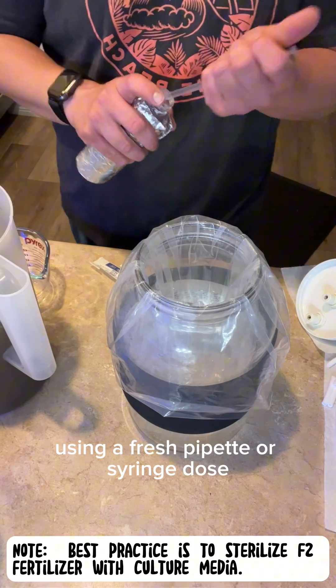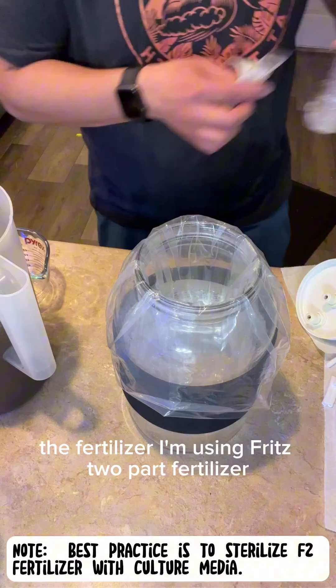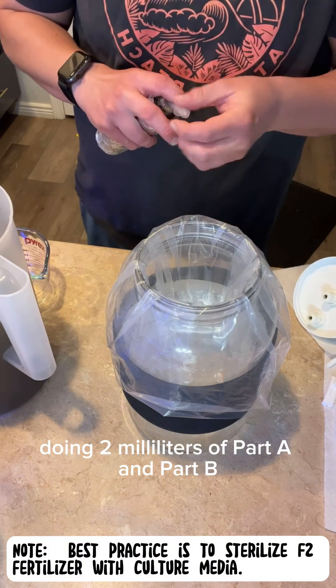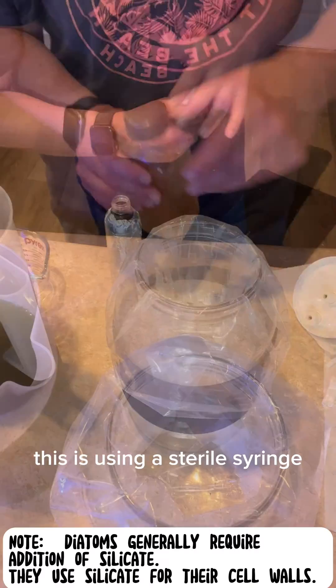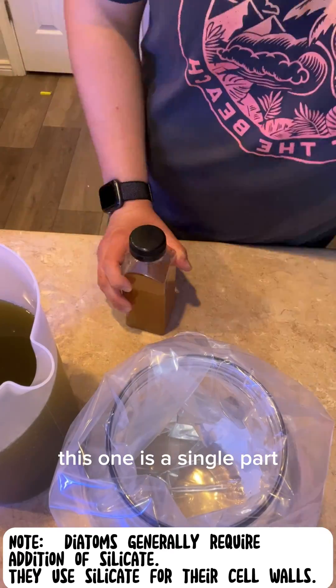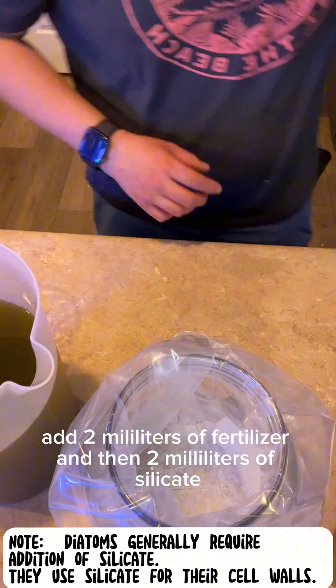Using a fresh pipette or syringe, dose the fertilizer. I'm using F2 two-part fertilizer, doing two milliliters of part A and part B with a sterile syringe. For diatoms, I like to use a different F2 fertilizer — this one is a single part. Add two mils of that and then two milliliters of silicate.